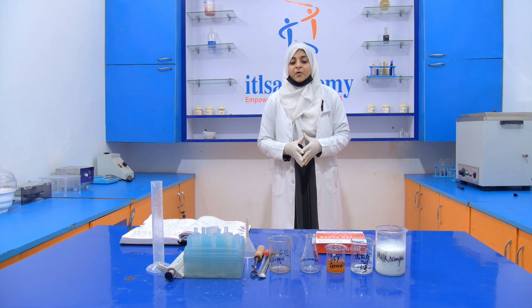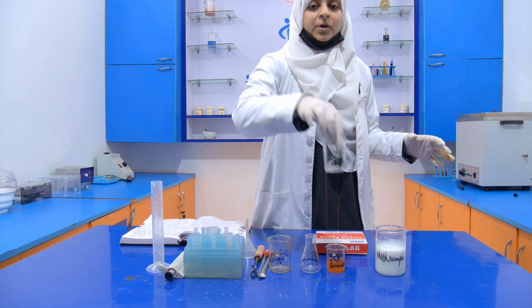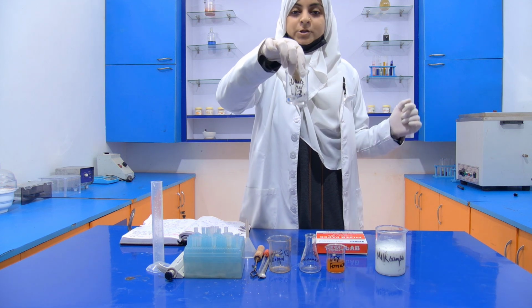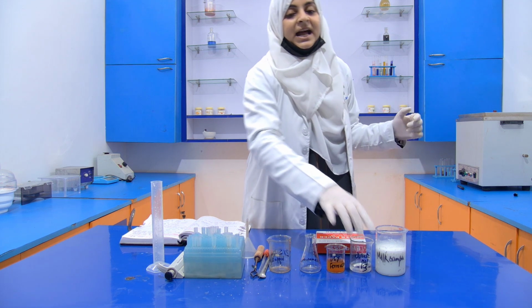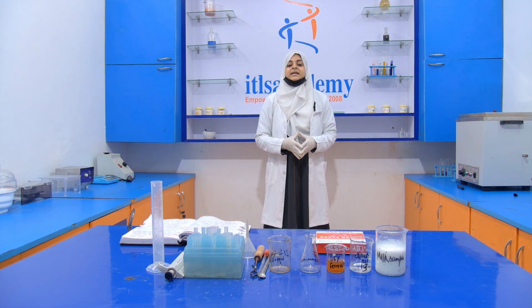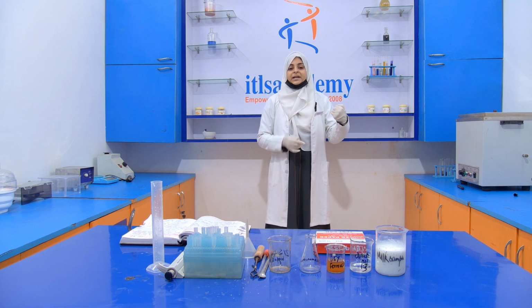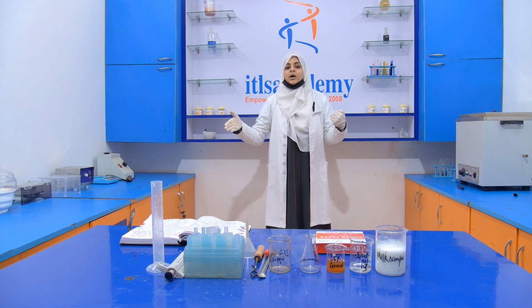For performing this experiment, we require two chemicals. One is dilute HCl, that is 1:3, which means that if we take 1 ml of HCl, then we take 3 ml of distilled water and we convert that concentrated HCl into the dilute form.